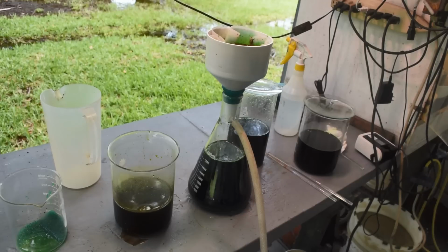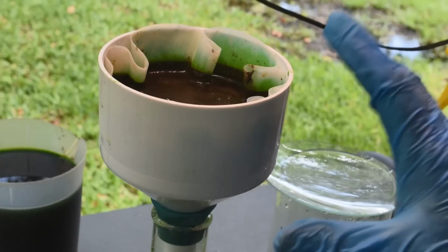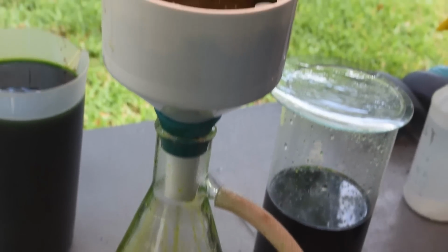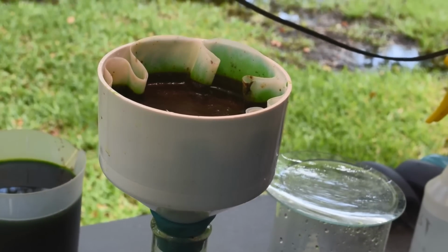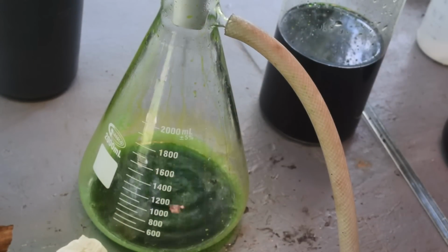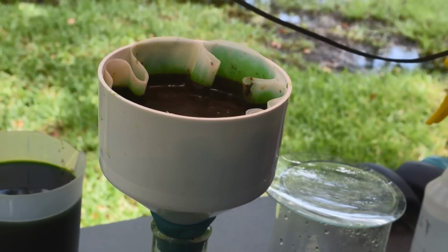Okay, we are getting quite an accumulation of it up here in the filter too, which is a beautiful thing. Okay, we are getting such an accumulation of the red salt up here that the filter is clogging up and really slowing down. So what I might have to do is change out filter papers. We might have multiple filter papers full of red palladium salt here before we're done, just because this is going to take all day to filter at the rate it's going, and I still got a couple liters to process. We're going to have a lot of palladium here. This is exactly what I was hoping.